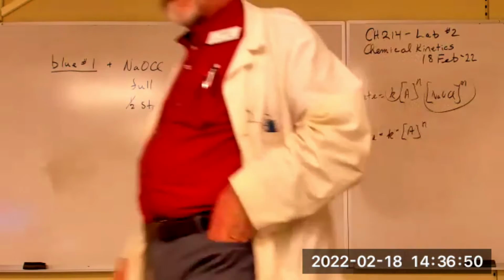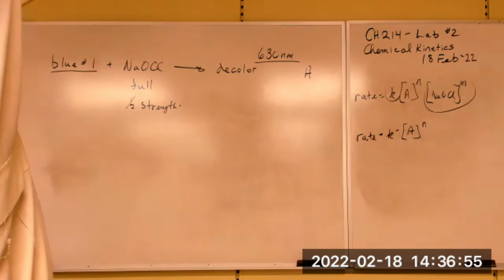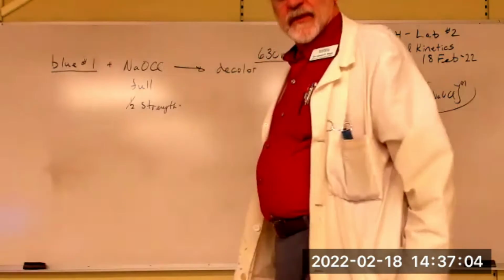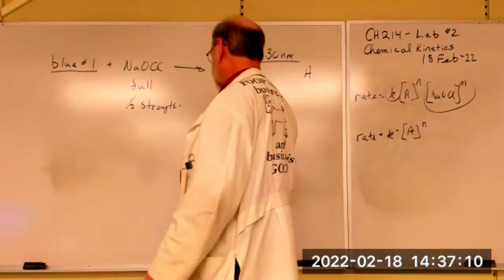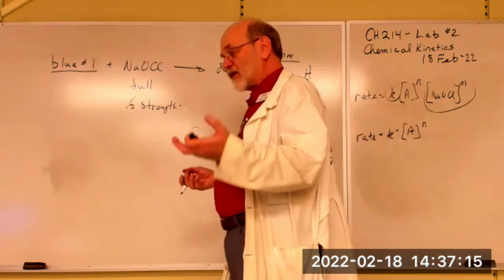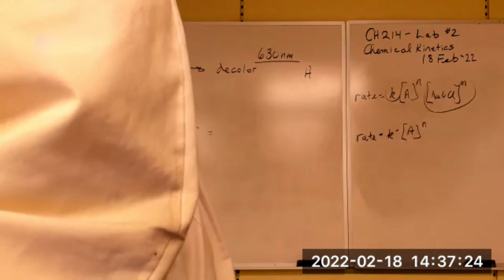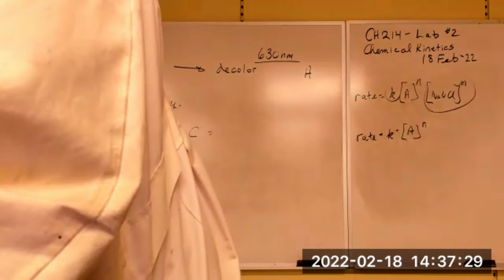Okay. How much more do I need to say about this? You know what absorbance is? Absorbance, Beer's law. Ever heard of Beer's law? Okay. Beer's law simply says, well, it's got three factors. The concentration of some molecule in solution can be determined by, let's see, an absorptivity constant. I want to use the right lettering here.